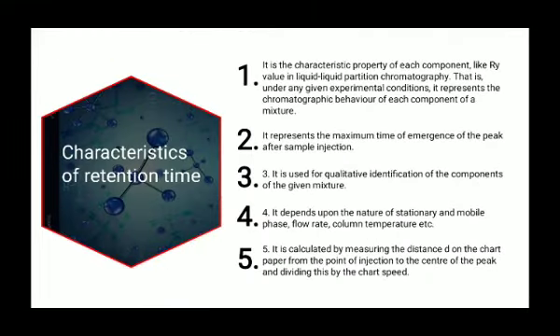Characteristic of retention time: it is the characteristic property of each component. That means, under the given experimental conditions, it represents the chromatographic behavior of each component of a mixture. It represents the maximum time of emergence of the peak after sample injection. It is used for qualitative identification of the components of the given mixture.